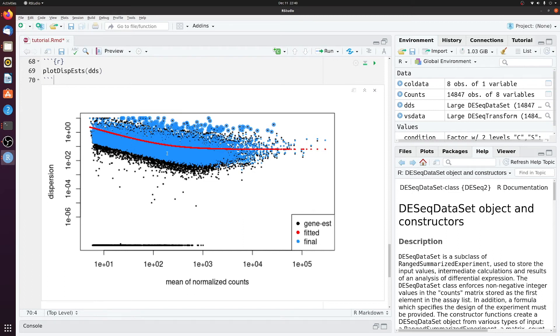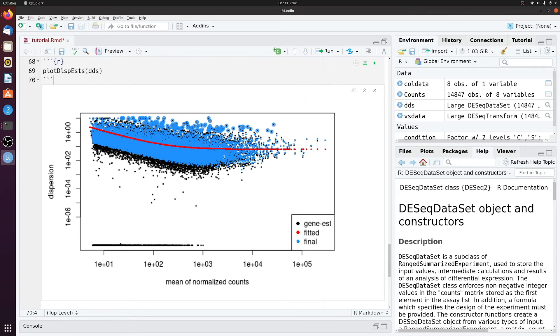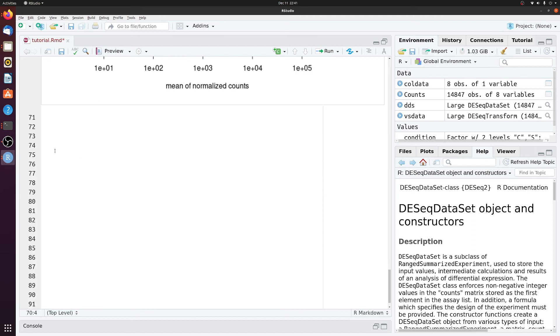So the main thing here is you want the data to be below 1, or not the data, the red line. You want the red line to trend below 1. And the lower it is, the better. So here we do see that it does trend below 1. But it's not really as low as I would usually like. But I would consider this to be okay, but not great. Anyways, let's move forward.